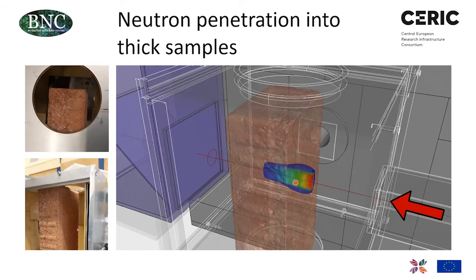And this works by generating a large number of random numbers by computer. And it has model functions to describe the individual events of neutrons and photons and electrons. And they are parameterized, so you need huge numerical databases to feed these algorithms.